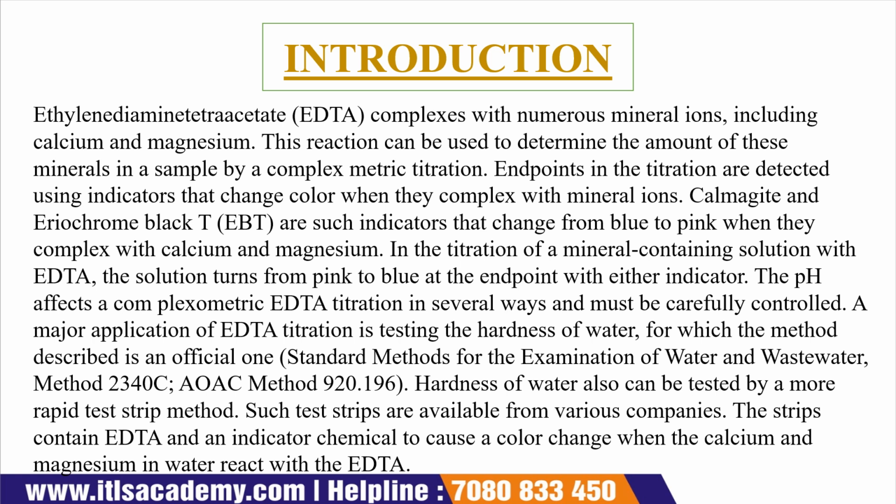This ethylene diamine tetraacetic acid forms complexes with numerous mineral ions, like calcium and magnesium. The reaction is used to determine the amount of these minerals present in a sample by a complexometric titration. We use the complexometric titration method so that we can determine how much of these minerals are present in our sample.